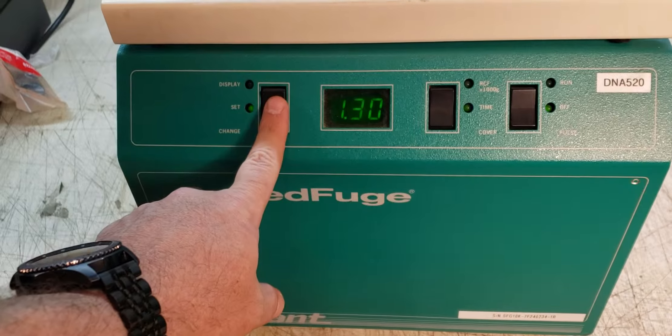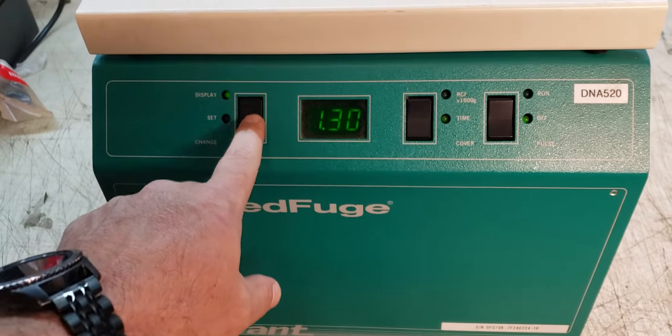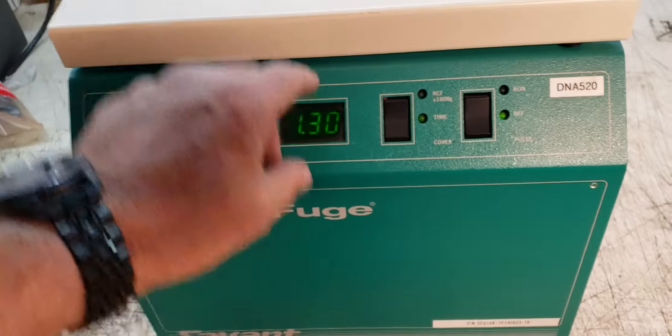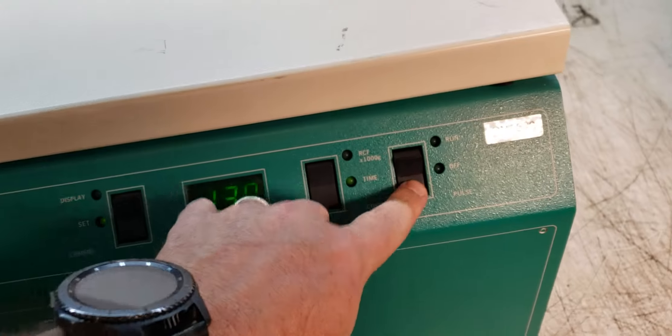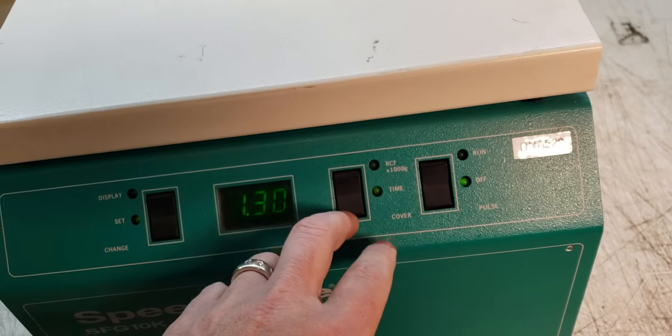There's got to be a way to set it. I don't understand the nomenclature — maybe you do and you're looking at me going, 'oh, just click that button.' Oh, it won't let me open it.